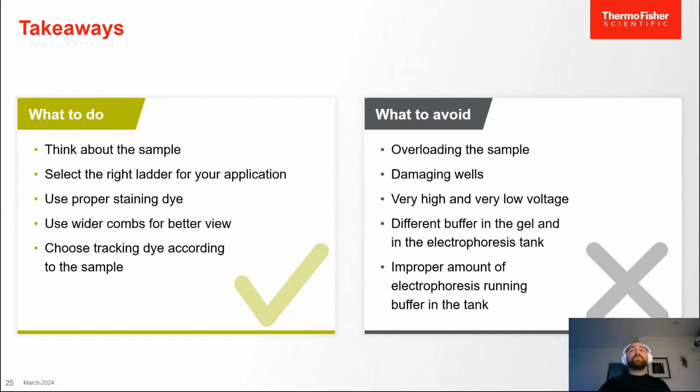Okay, so things to avoid: overloading the sample, because you won't get proper separation; damaging of the wells, because you will have funky wells, as well as leaking of the sample, potentially cross-contaminating or just leaking the sample out of the gel.